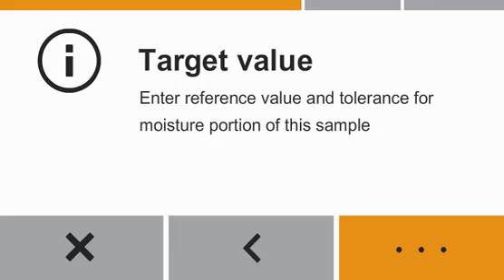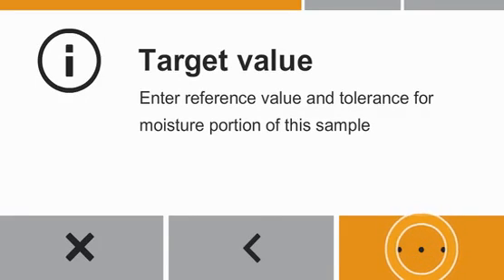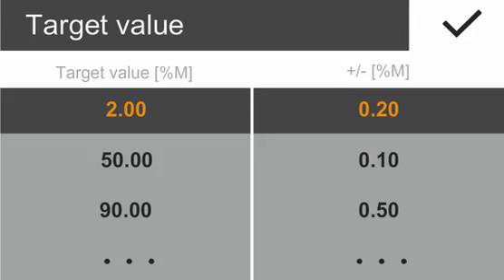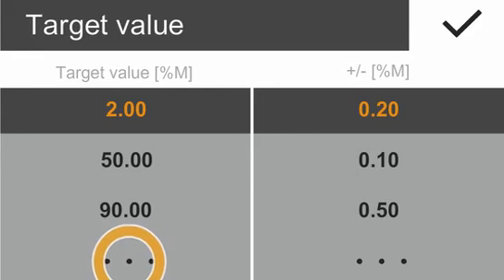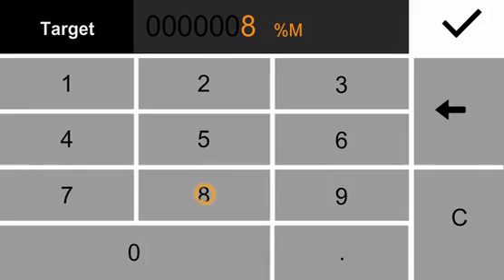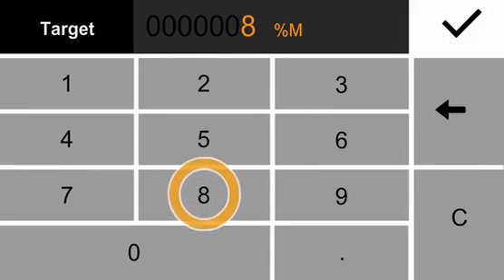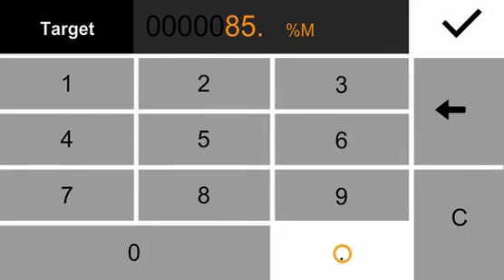Please enter the target value of the sample and the tolerance for the moisture content. In our case, the target value for ketchup is 85% moisture content. The tolerance value is 0.5%.